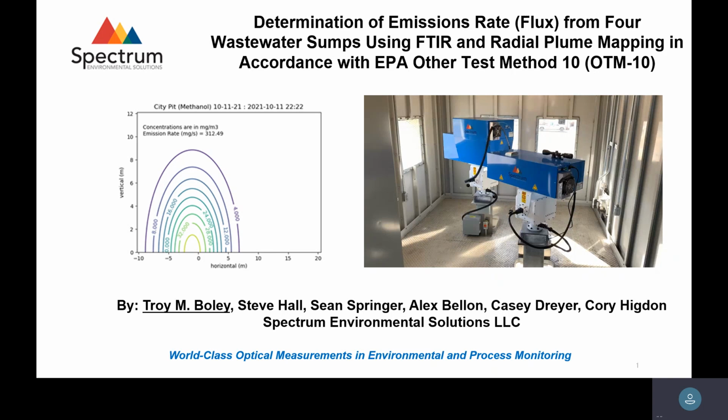Basically, this is an EPA method. This is an EPA approved method for determining mass. So that's different than just the open path concentration, path integrated concentration. Concentrations are interesting. Those are compared against health-based limits and effect screening levels and other things for concentration, yes or no, pass, fail. But if you want to do permitting, people do not live in a world of concentrations.